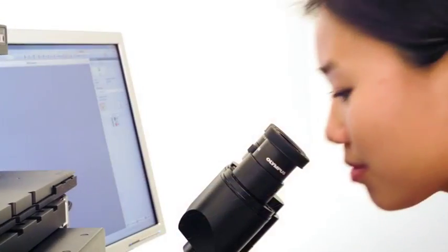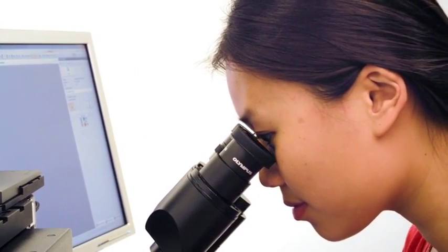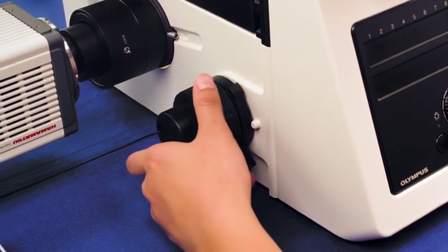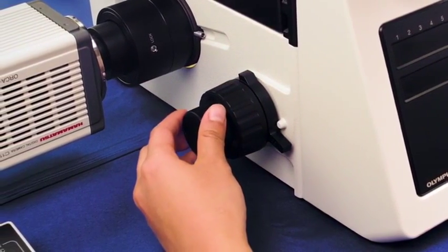Common to all IX-73 models, the pre-focusing lever, when engaged, prevents coarse focusing above the desired focal point and reduces unwanted collision of the objective lens with the sample.